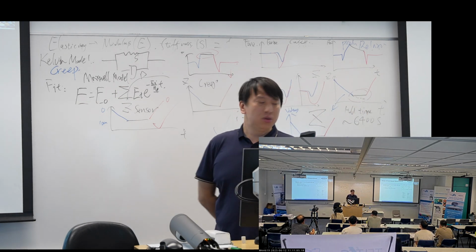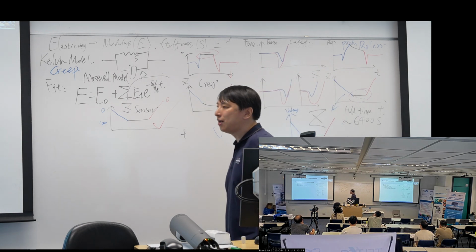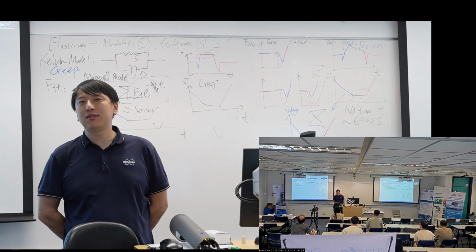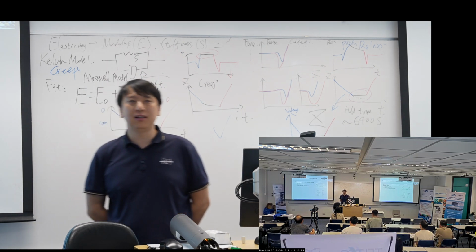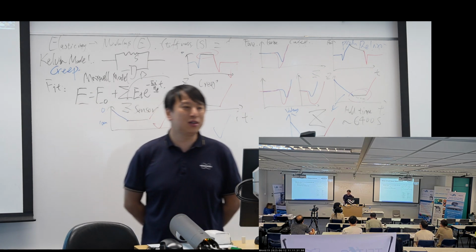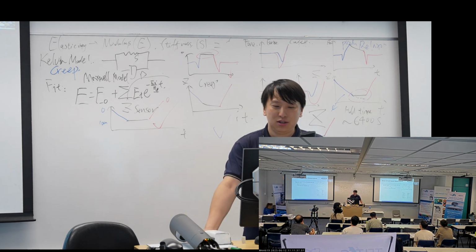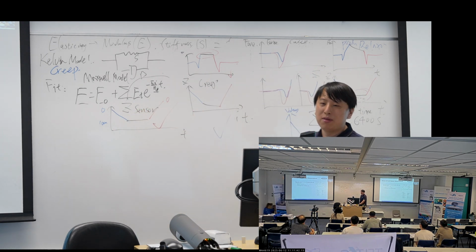So we will definitely try ramp and hold as the first test in the afternoon. We will use different samples to show the results. We have the PDMS and the polystyrene, they are typical polymers. And we have graphene, the HOPG. That's a pure crystal, and it is elastic, so we will not see a significant creep. We will just show you how it works. Okay, so that's about ramp and hold.